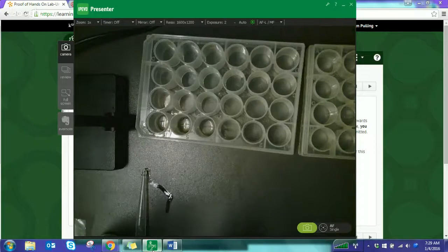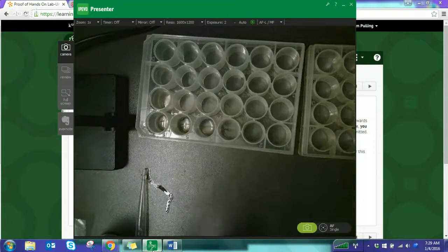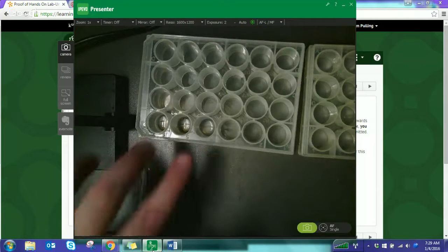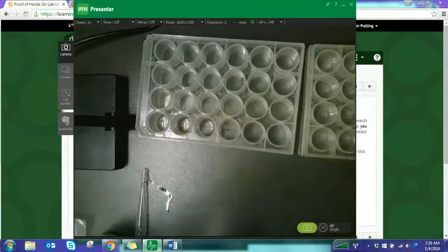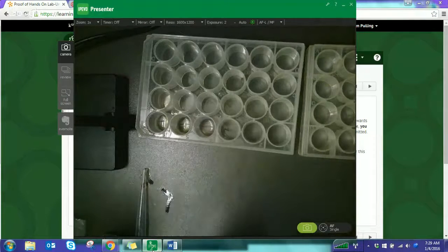And then you're going to repeat that pattern for the next 4 and repeat that pattern again for the last 4. And you're going to end up with each color. So in these first 4, you're going to do black, middle 4, do red, last 4, do blue or green, whichever color you end up sticking with.